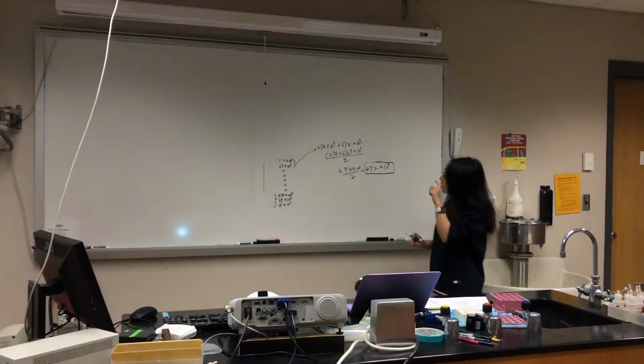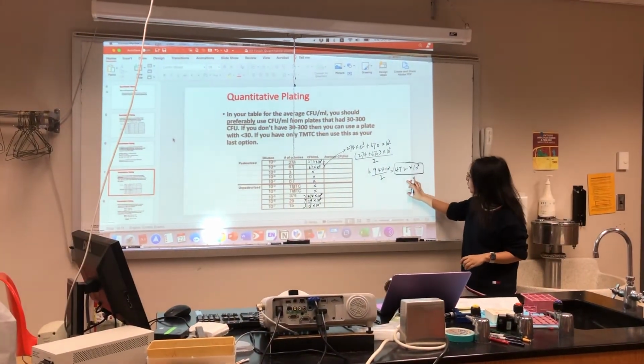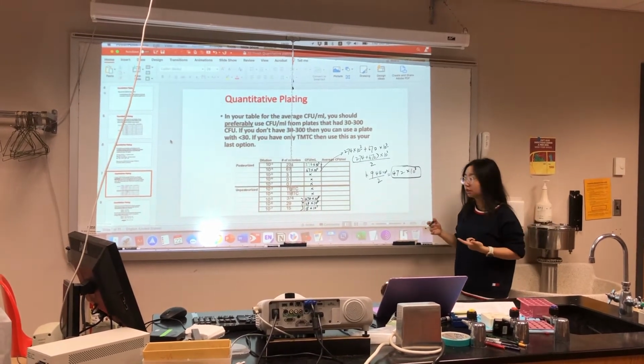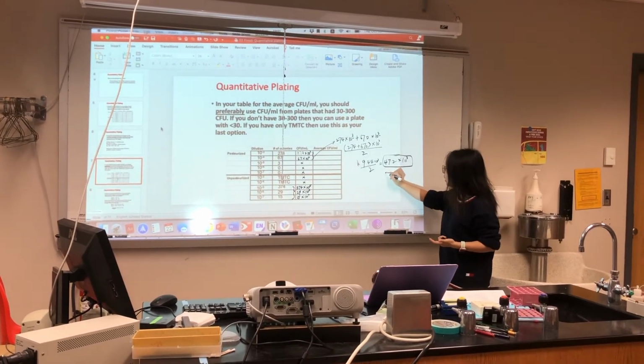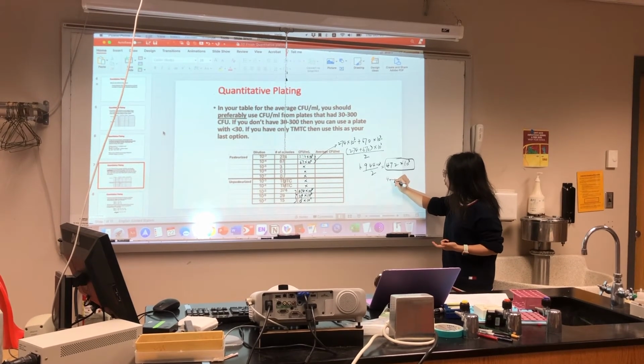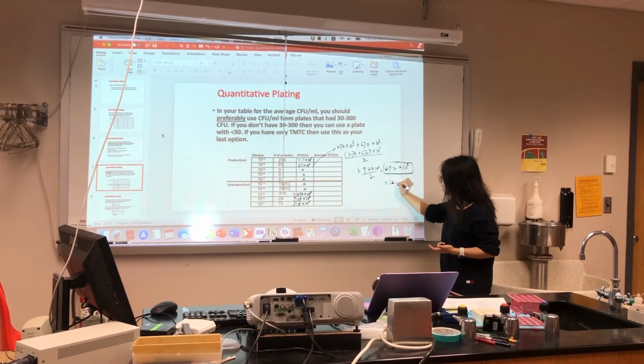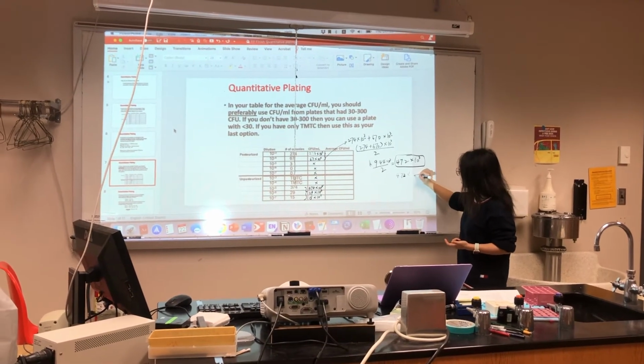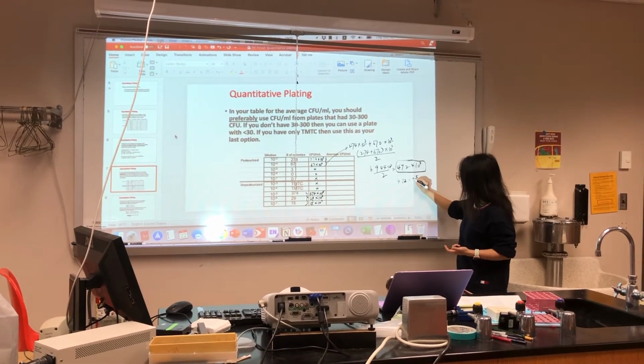And another thing I want to show you is we want you to write in scientific notation. So we need you to write 4.72 multiplied by 10 to the 5th.